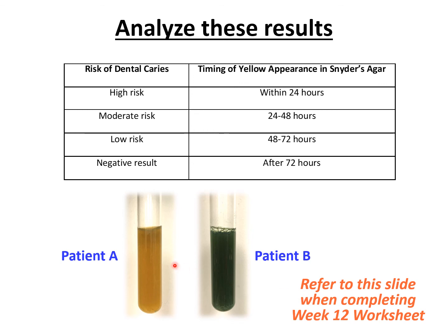And as I said, all of us, when you do this test, are eventually going to get this yellow color. It just depends when you are going to see that yellow color. The faster it turns into that yellowish color, the more at risk you are of developing tooth cavities.